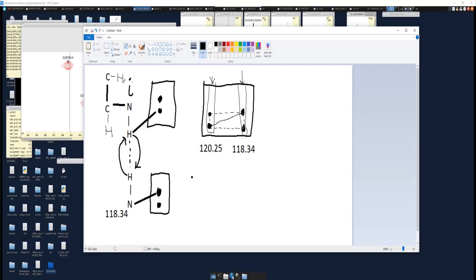Excuse my lack of artistic ability. So each of these will have their respective hydrogens. And this amide that you're looking at can also correlate to itself, but its nearby neighbor, right? So let's just show this as an example. It can show up with its nearby neighbor, which is what we've been seeing. And subsequently, its nearby neighbor, this guy, let me change the color of the brush here to red.